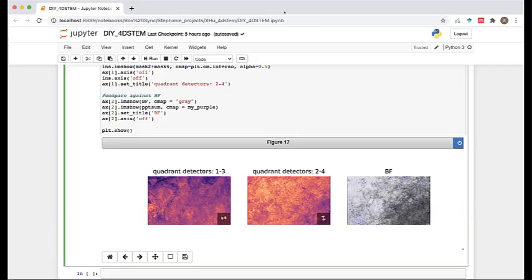The second question is if this would work directly with the DM, with the digital micrograph. I guess the answer is that as is it would not. You have to do a few modifications and then create, outside of Jupyter Notebook, a .py file, basically copying the information from the kernels that Stephanie showed.